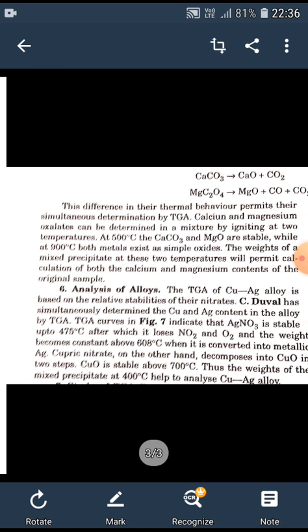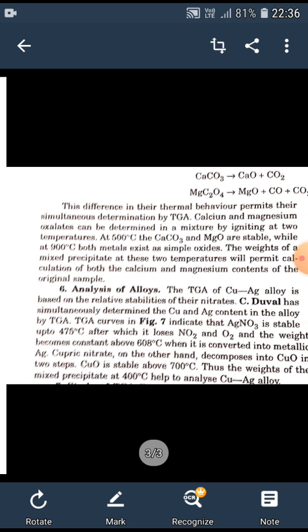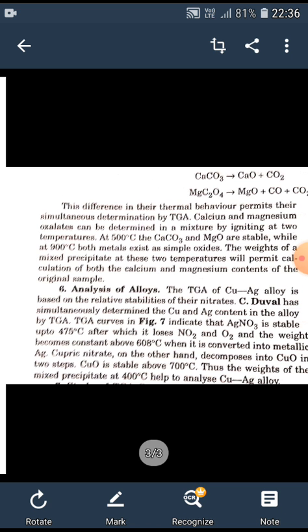In these methods, a change in some physical property like weight, enthalpy, length, or volume as a function of temperature is measured automatically. The reactions involving change in weight are used to study reaction kinetics. The next application of thermogravimetric analysis is in the measurement of surface area.